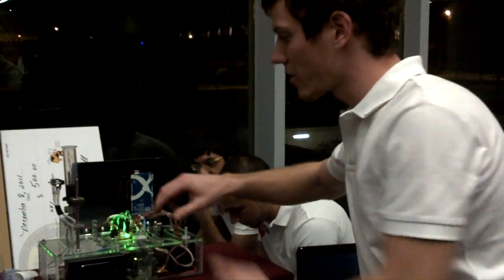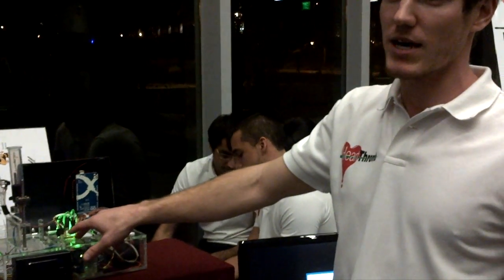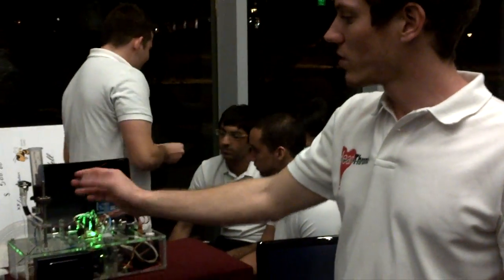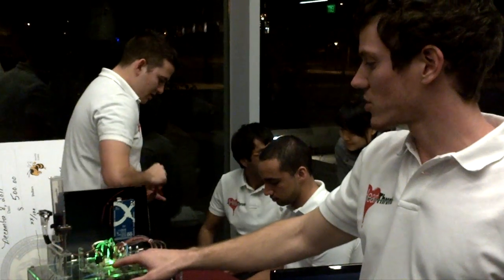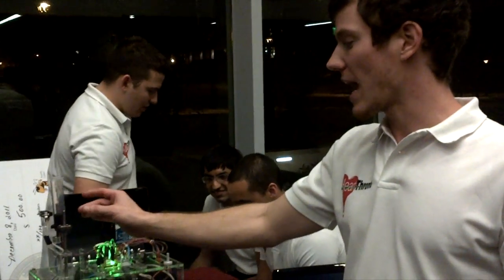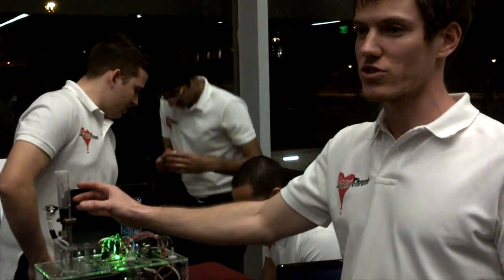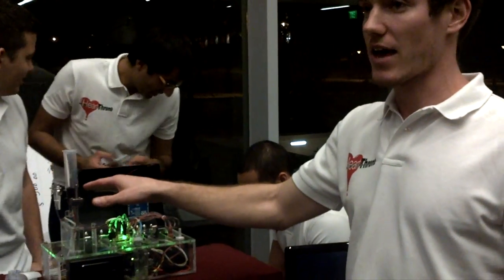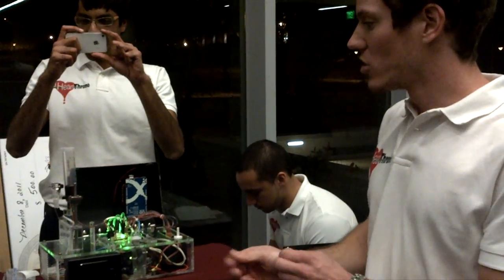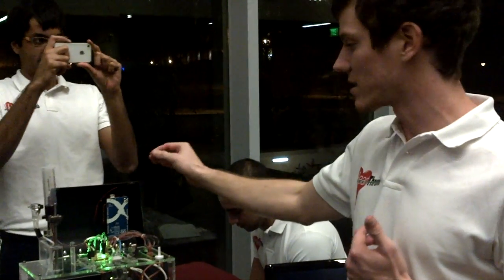Now our little pressure monitoring system, this keeps our blood pressure down here at 0.2 psi, which is what we need to make sure the test is valid. So what it will do is it holds the blood level at a certain height, and that generates a certain gravity pressure on the blood down here. So to keep it at that level, we have this device here which slowly raises the syringe to keep the blood line at that level as the blood drains out. So when it gets to the actual blood level, it'll stop and hold until more blood drains out.